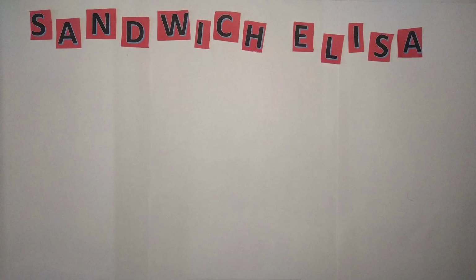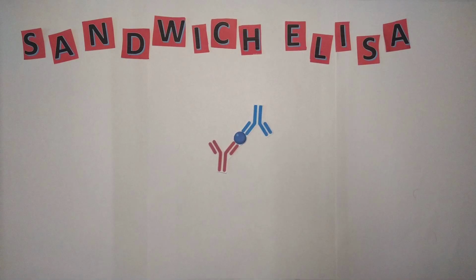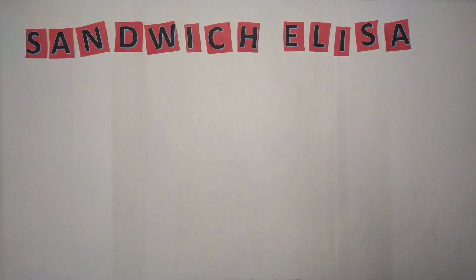It was discovered in 1977 by Cato and his workers. It's called sandwich because it involves capturing the antigen between two layers of antibody, much like a sandwich. The antigen used here must be at least bivalent. Let's see the protocol of sandwich ELISA.